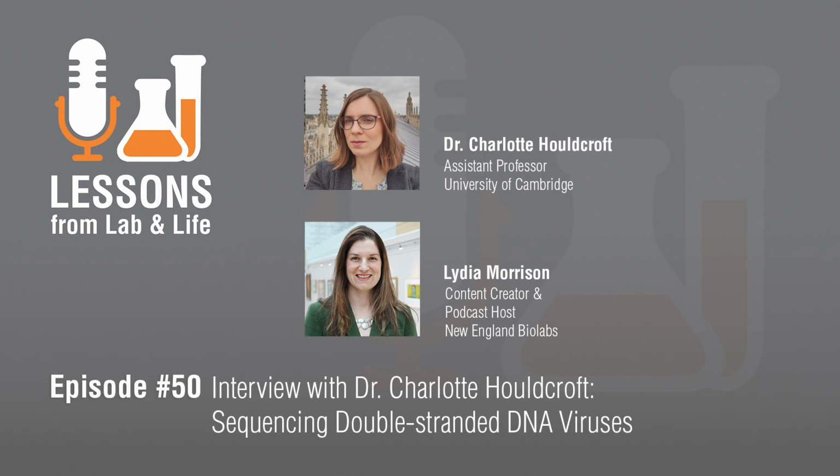But with increasing use of metagenomics, of really high depth sequencing to get good quality human genomes, and then use of metagenomic classifying software to look at what are all the other reads that are not the human genome, I think now researchers are more understanding that you might find both endemic and epidemic pathogen DNA in ancient remains from all kinds of settings.